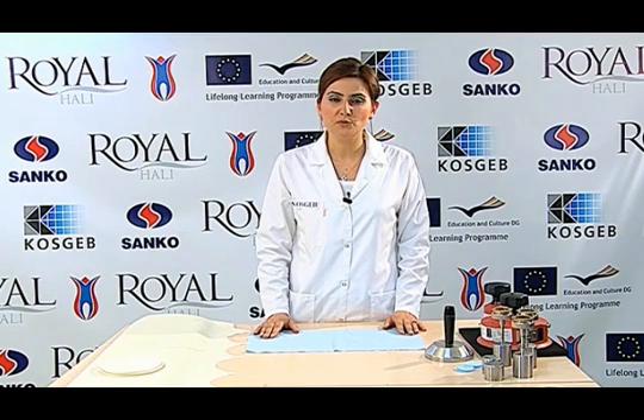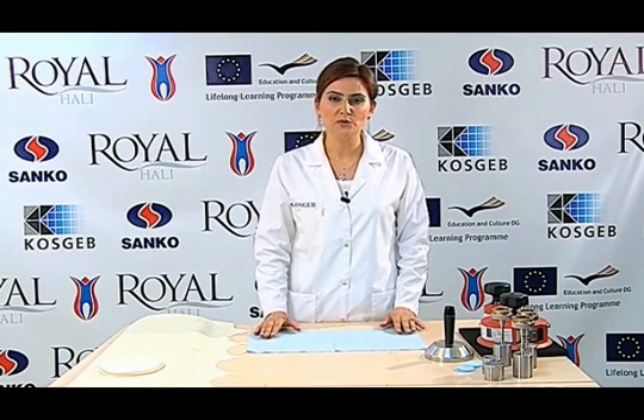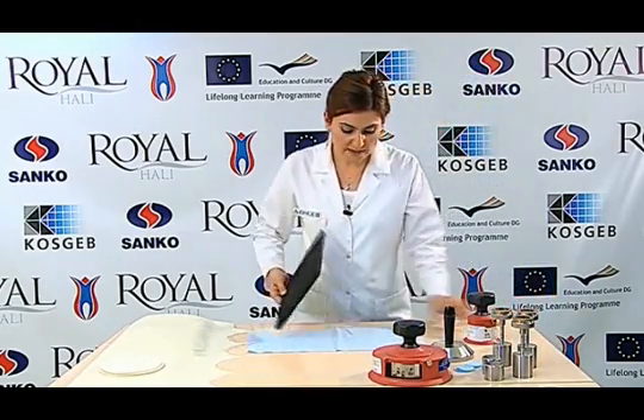First, the test specimen is conditioned under standard atmospheric conditions for a minimum of 24 hours. We then spread the conditioned test sample on a flat surface and take a 38 mm sample from the spread specimen.